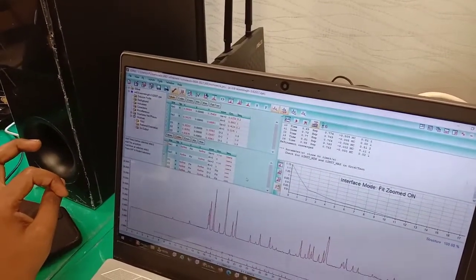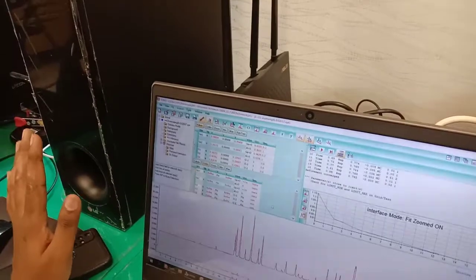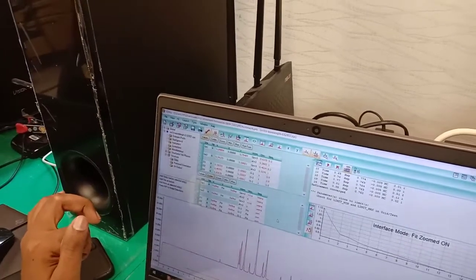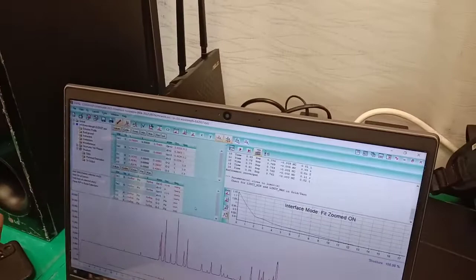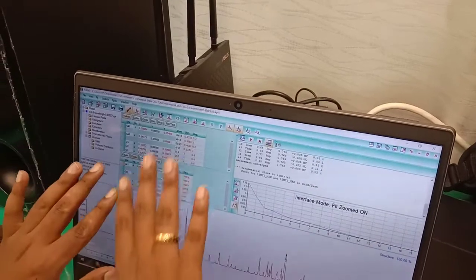Of course we have to open it. You can also close and refine it. For normal cases, as a final refinement, you have to open everything and refine it. But in some special cases, like when you are using lithium, you cannot open everything at the same time, because lithium XRD is not sensitive to lithium. So in that case you do not need to do this.